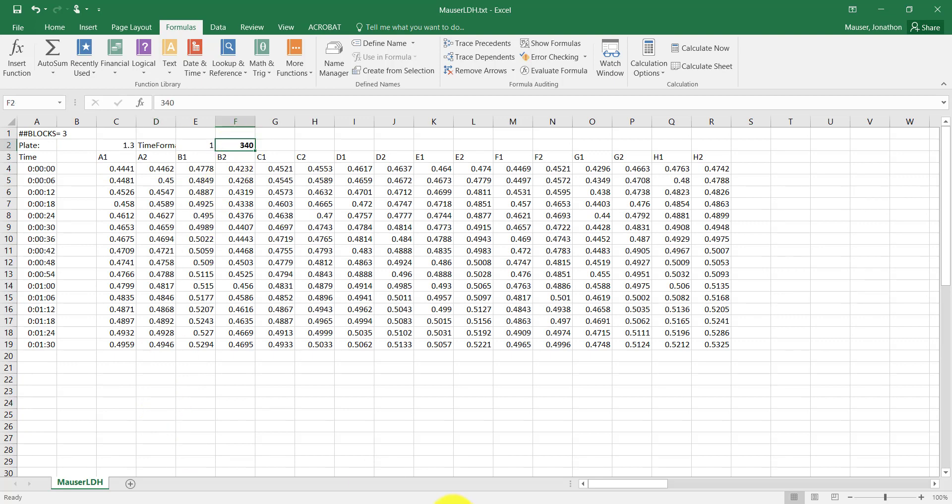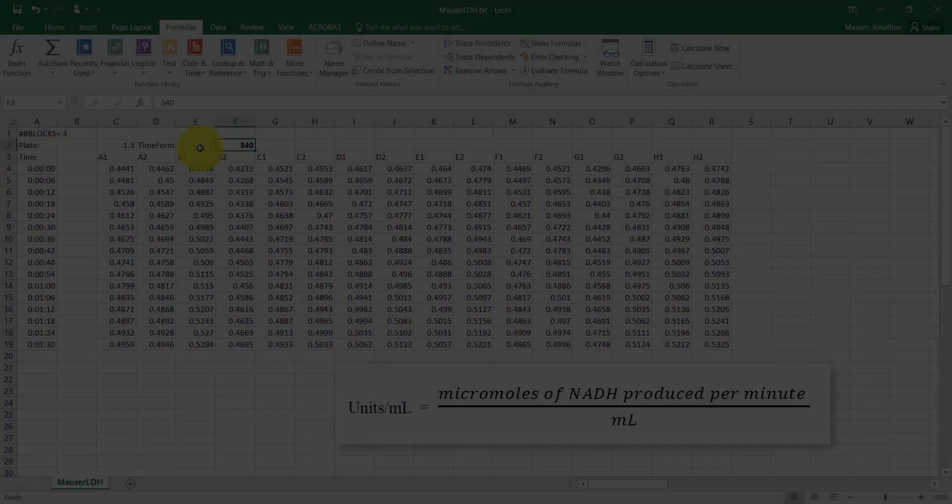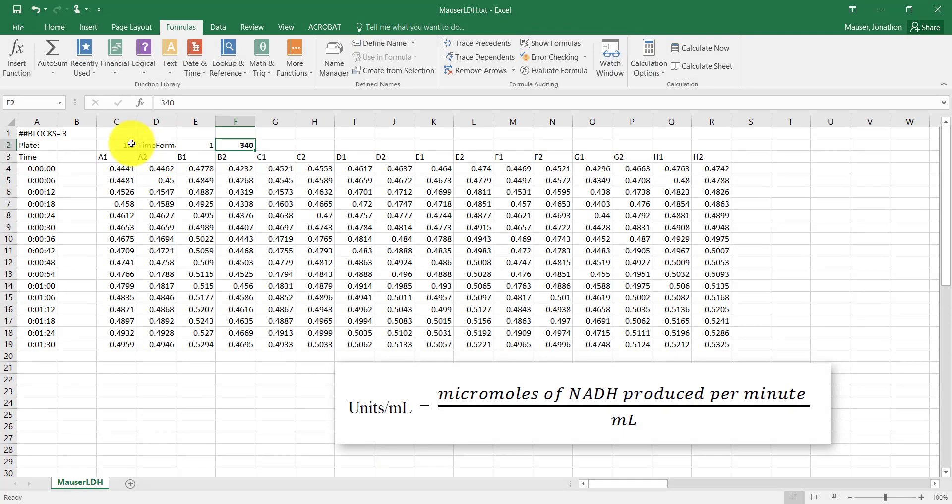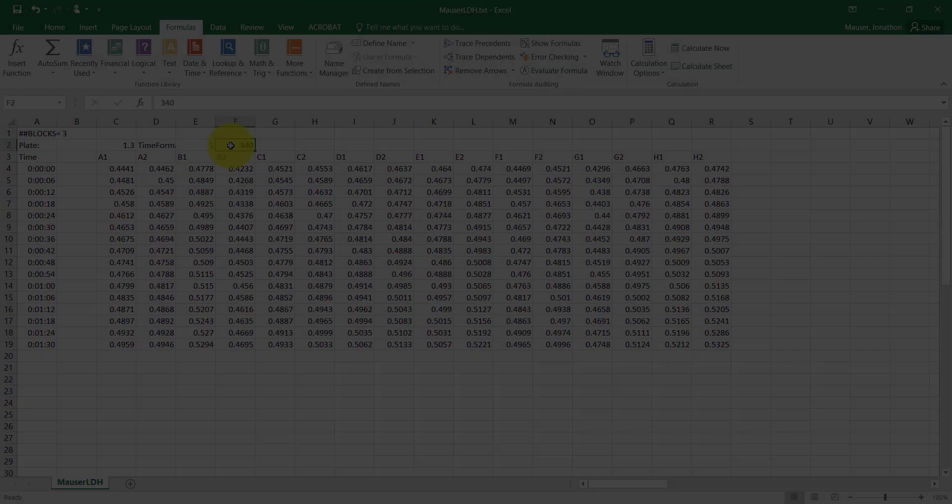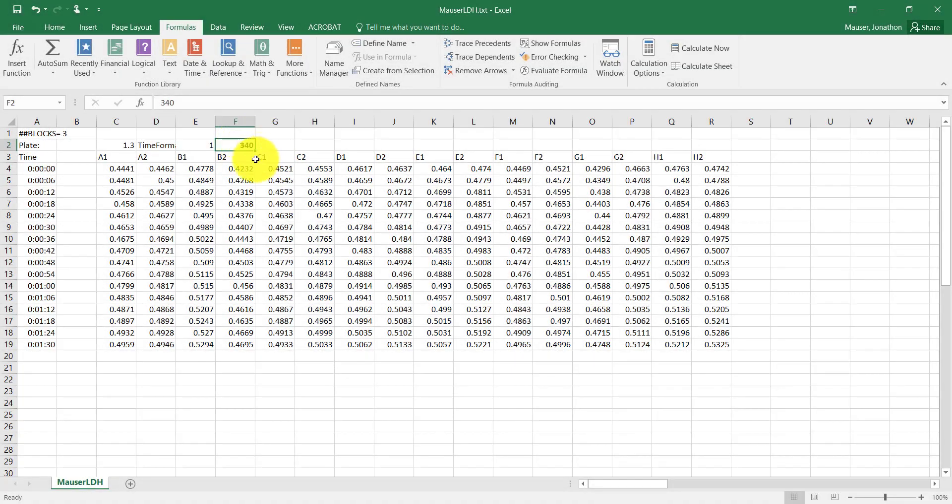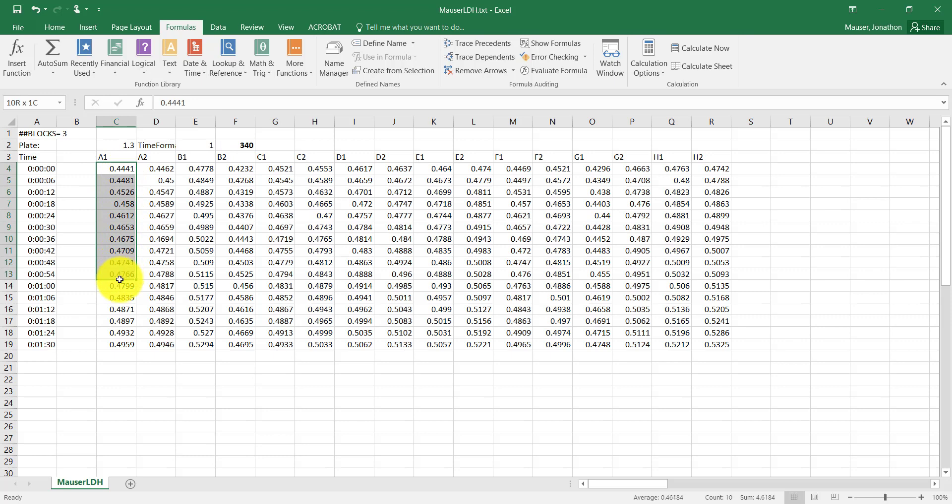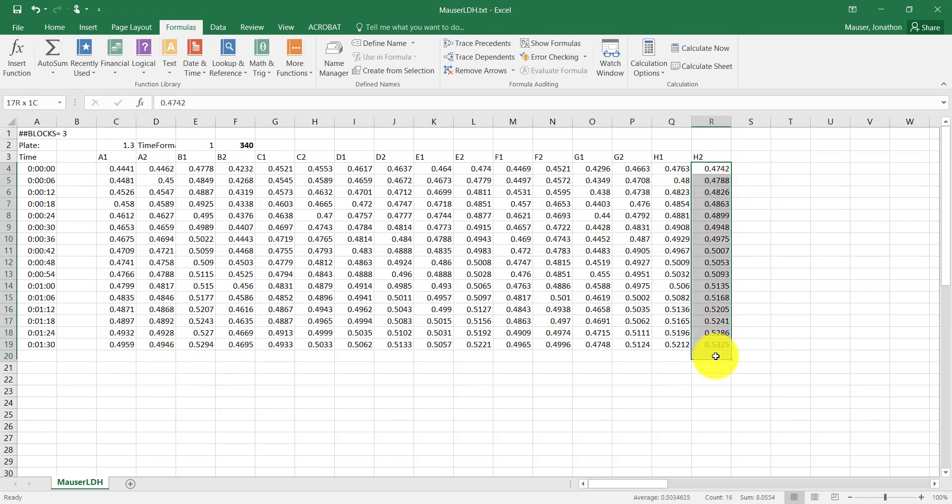So as NADH is made in this activity assay, we're going to end up with a higher A340 over time. And you can actually see here that the absorbance at 340 increases over the course of the experiment. And you can also see that in all of these wells, which is a good thing.